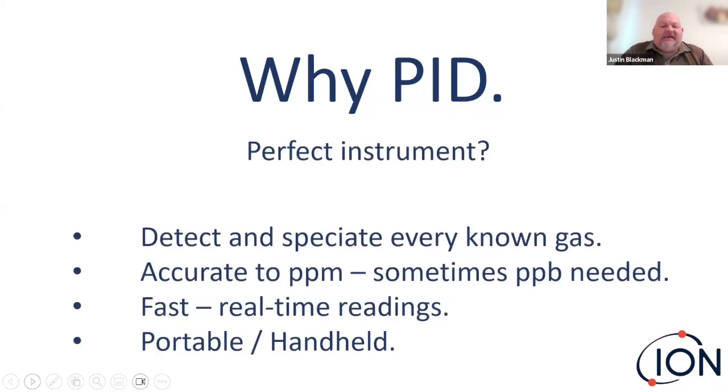Very quickly, I think a perfect instrument would be able to detect and speciate every known gas. It would be accurate to ppm, and sometimes we would need ppb. I would need it to be fast with almost real-time readings, and I would want it to be portable and handheld. I think those are a perfect instrument.